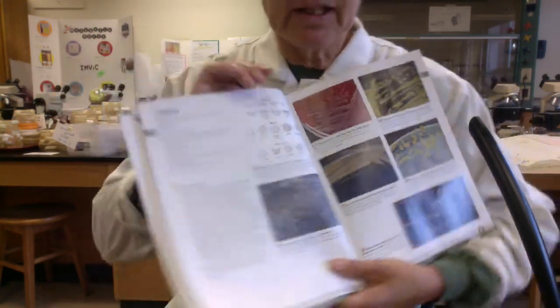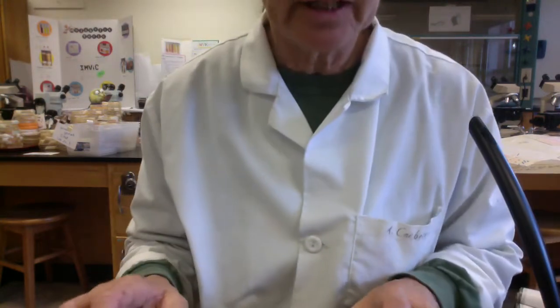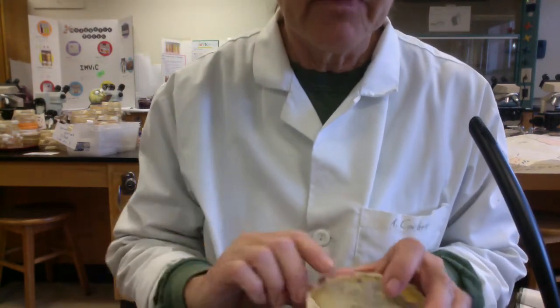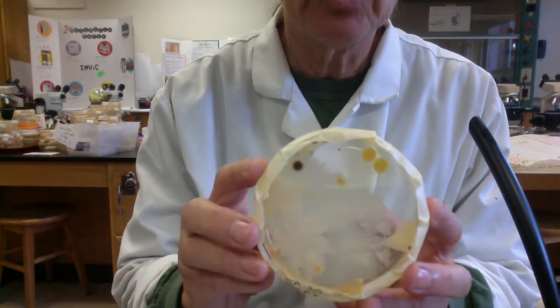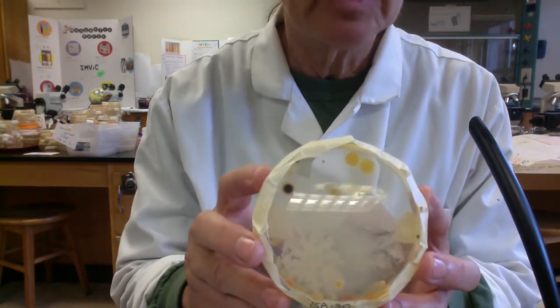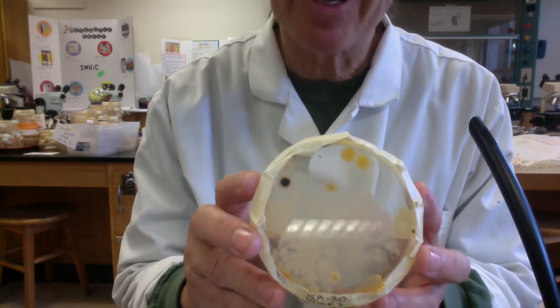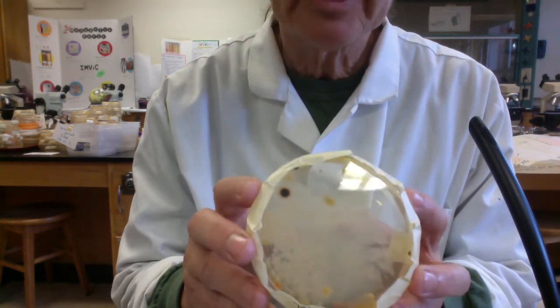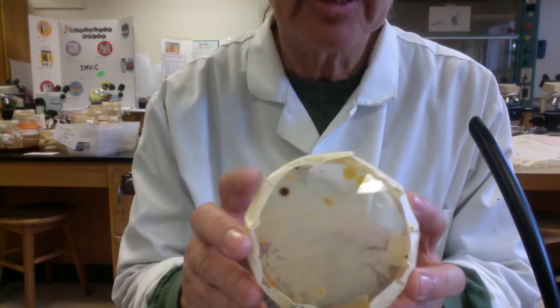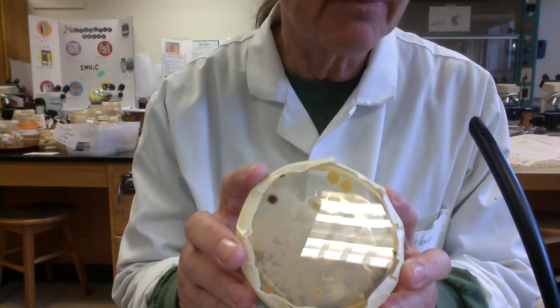So folks, then just with regard to cleanup, when you're finished examining your plates, you'll keep them taped together. And indeed, you guys, on this experiment, I'm going to suggest that we tape all the way around the edges because some of the fungal colonies are very aggressive. We've had them try to grow out of the plate, kind of like a science fiction movie. So we'll keep our plates taped together, and then we're going to throw them into the biohazard or autoclave bags or bins. Okay.